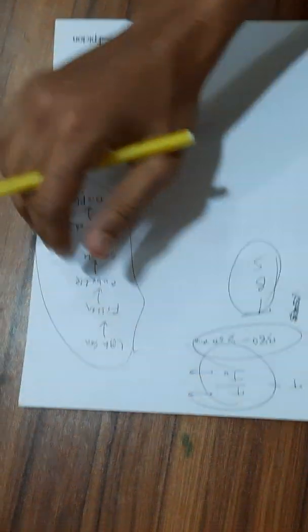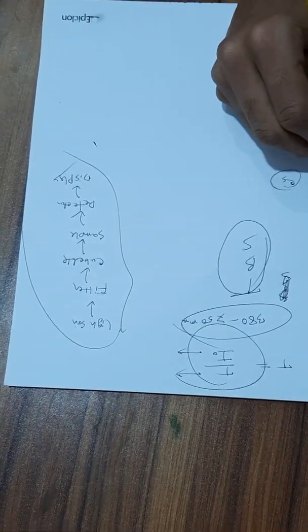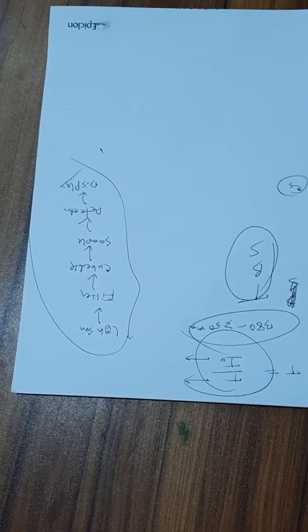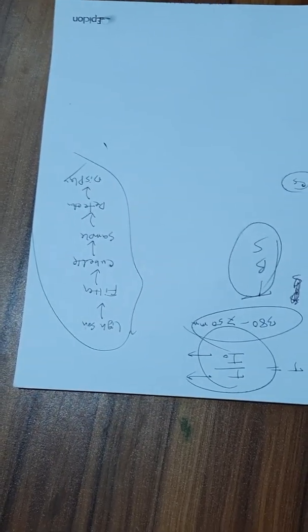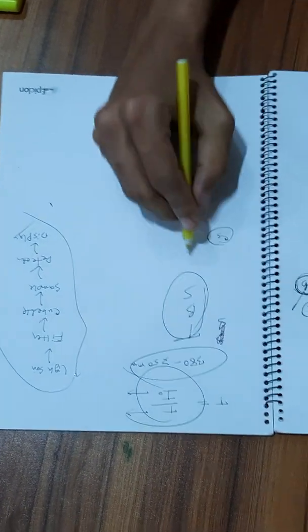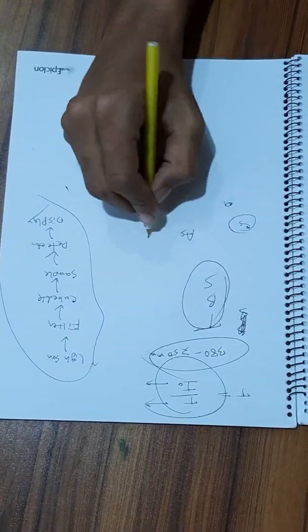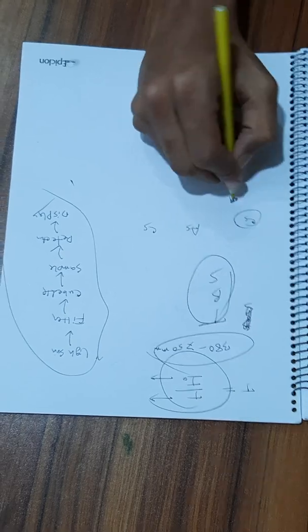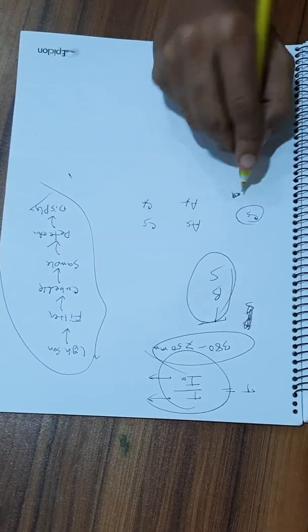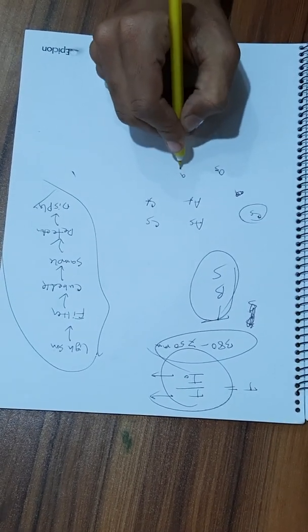Now, the measurement of concentration using the standard solution. We have already said that there are three test tubes: test, standard, and blank. Now, absorbance of standard, concentration of the standard, absorbance of test, concentration of the test, and molar absorbivity of standard and of the test.